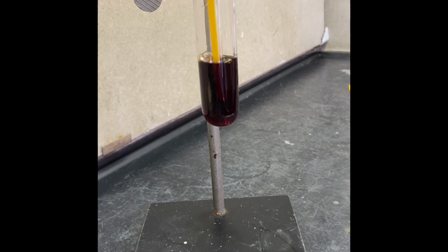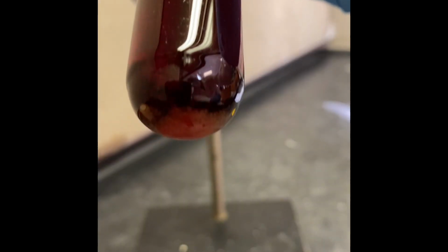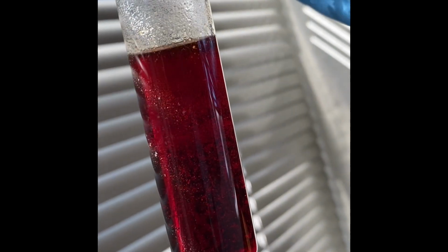I'm pouring the ethanol, the temperature reach 100 degrees. Slowly, 15 milliliter of the alcohol. Now we're waiting for the crystallization. As you see under test tube, some products forming. When it's getting cool enough, we're gonna receive more crystals. Yes, that angle may show you crystals forming inside the solution.